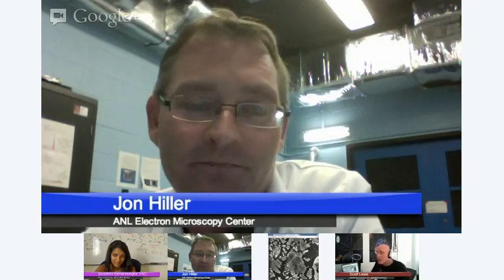So we have a one-of-a-kind transmission electron microscope housed in our facility here. And just to give you a little primer of it, it has 0.5 angstrom resolution, half of an angstrom. Wow. I didn't want to show any images of it because I want you to wait. Here's the teaser. Join us next time. This is the season finale, the cliffhanger ending.